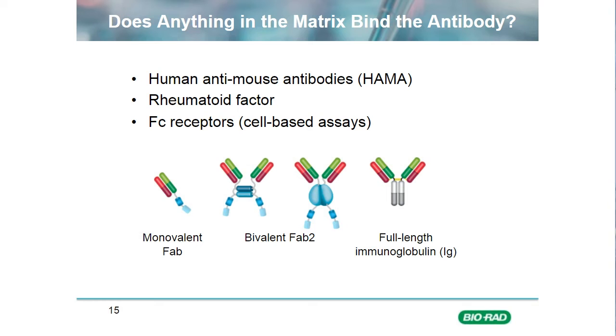Now, in all of the above cases, the issues arise from proteins in the matrix that essentially recognize usually the Fc domain of human IgG. So one way of avoiding these kinds of effects and having to use things like HAMA blockers or Fc receptor blockers is to actually use a format of antibody that doesn't even feature Fc. So some examples are given below. These are recombinant Fab formats, and also antibodies generated by traditional methods can have the Fcs cleaved off by papain or pepsin cleavage.